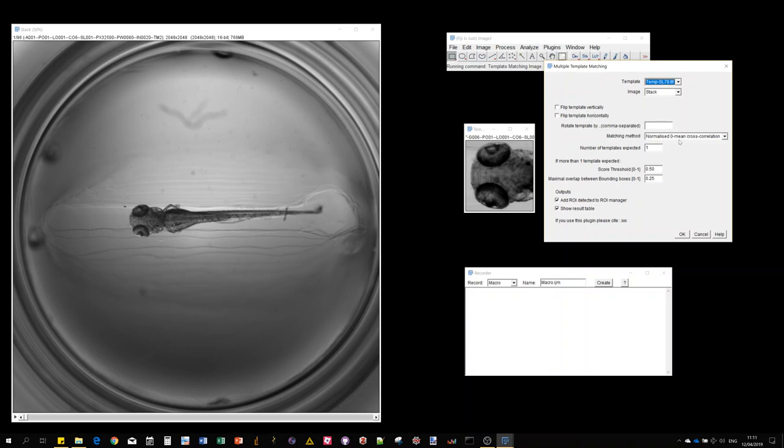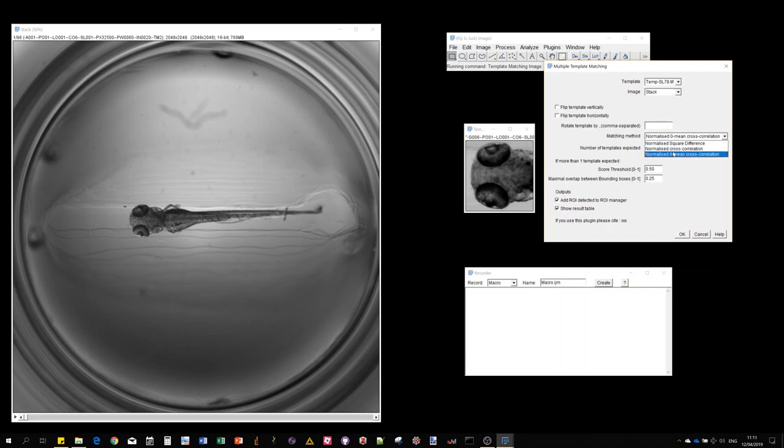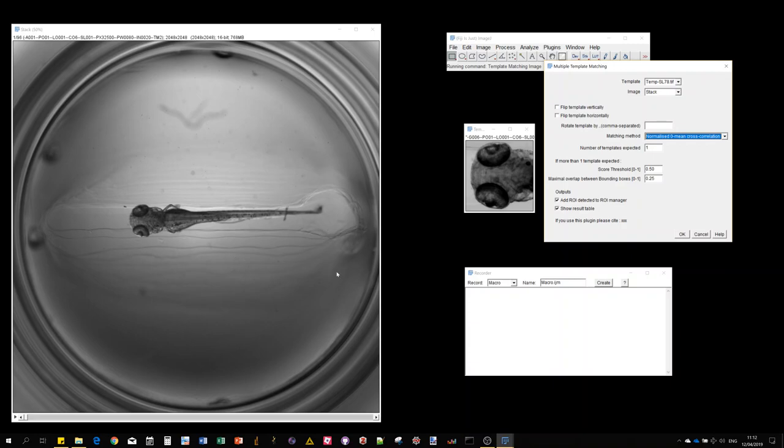For the choice of methods, you have three possibilities which are all normalized. This determines what formula is used to compute the correlation map. The algorithm takes the template image and scans the target image in a snake shape, and at every position computes a similarity score between the individual pixel values.